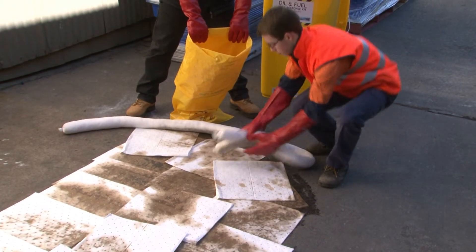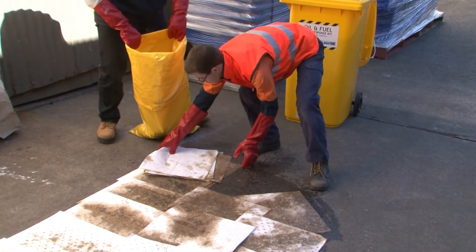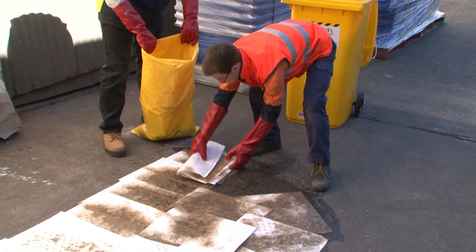Once the mini-boom and pads have absorbed the spill, place them in the approved heavy-duty polyethylene contaminated waste disposal bag. All contaminated material including mini-booms, pads, and Optisorb 40 can be disposed of in these bags.